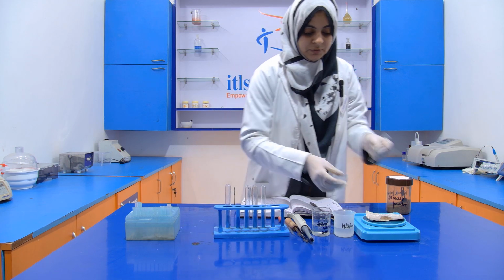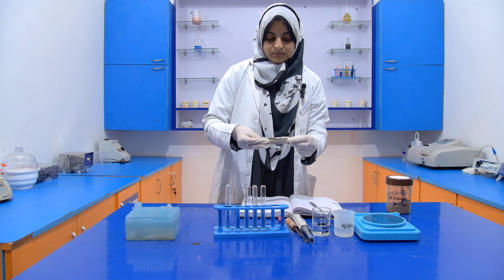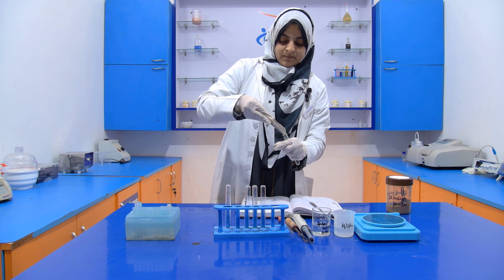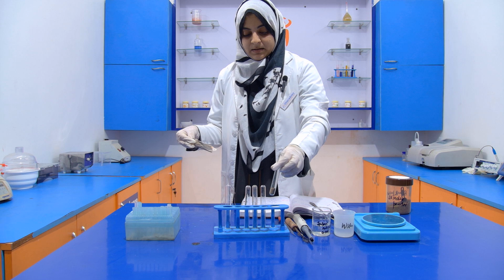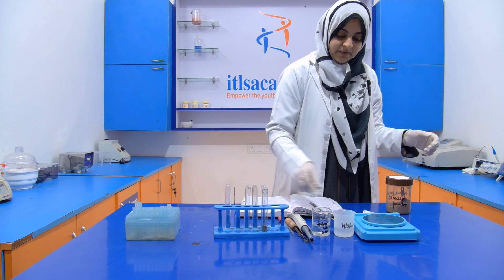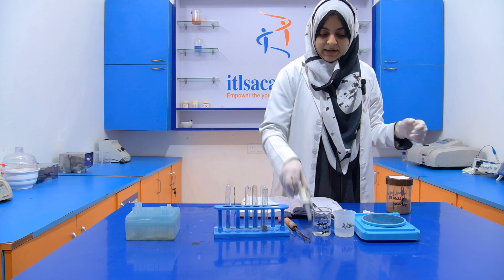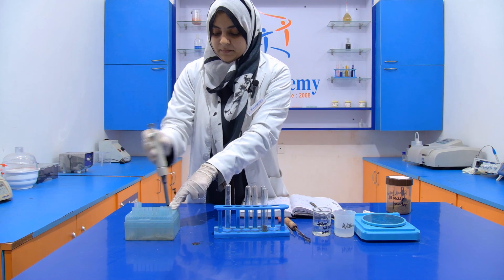Take a test tube, add 1 gram, transfer it very carefully. Then after that, we have to add 3 ml of water into it.